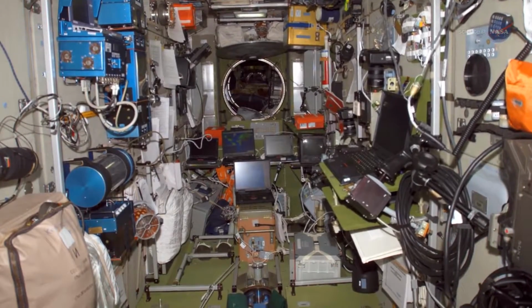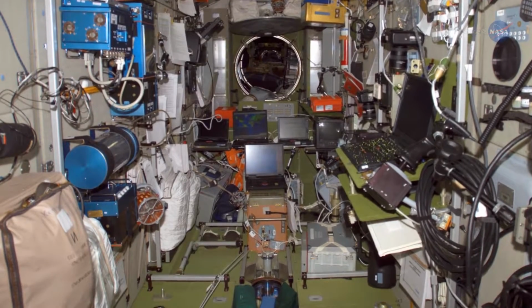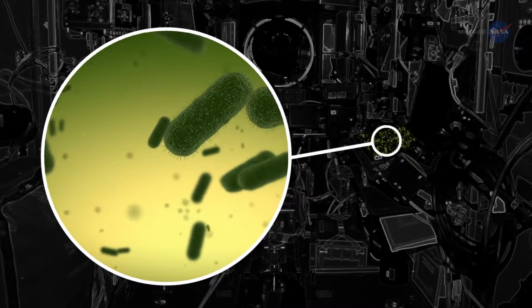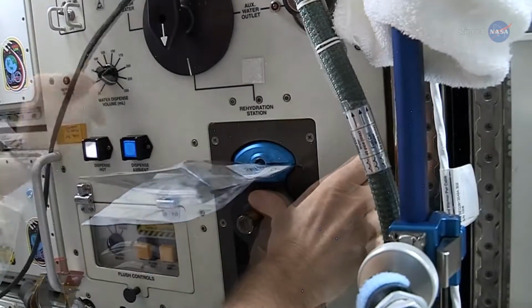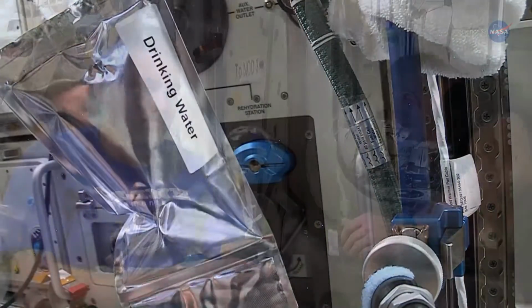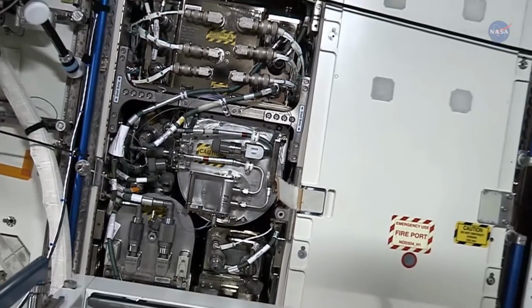As a self-contained spacecraft, the ISS slowly and inevitably collects microbes carried on board by astronauts, on the surfaces of supplies, inside foodstuffs. It's a bit of a microbial zoo. A DNA sequencer can help identify those microbes, as well as testing the cleanliness of air and water. Castro-Wallace says about 85% of the water on station is recycled, from urine, condensate, sweat, everything. "Is it being processed to where it's microbially clean? We want to know in a more real-time way if that water processor is working."